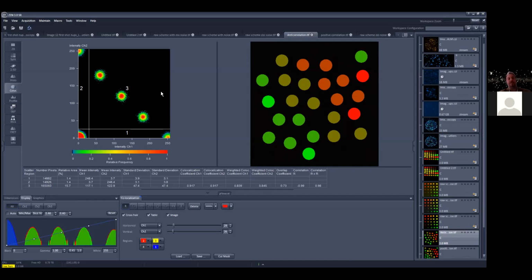So if you are looking at cells that express two genes, then one gene, as it gets more and more expressed, the other one gets less and less expressed. Maybe one is down-regulating the other one. So what we're looking for here is not whether two things are together in a specific cell, but what is the trend of this curve?